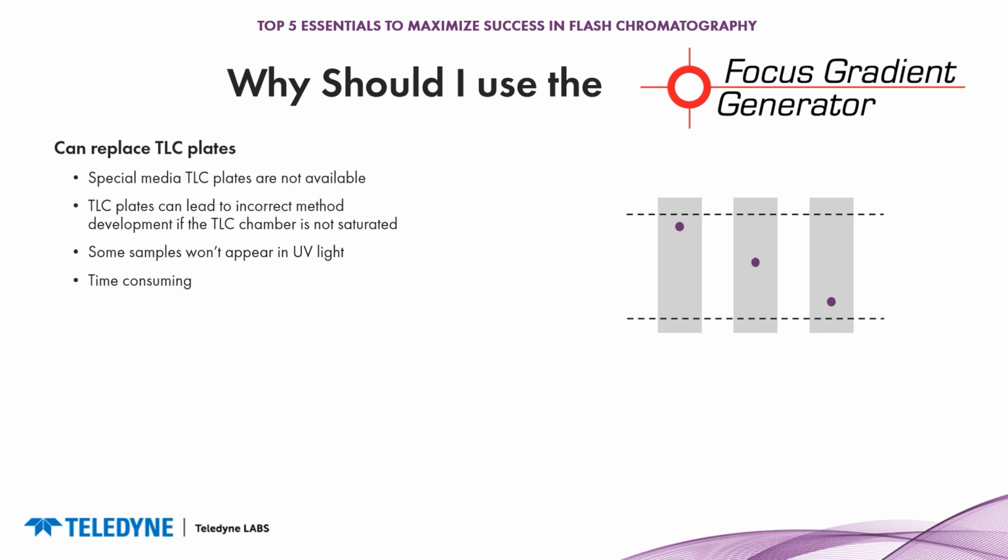A lot of the time silica TLC plates are going to be available in the lab. But what if you want to look at reverse phase and see how your compound interacts with a C18 media or a C8? Well, those C18, those C8 TLC plates are going to be a lot harder to find within your lab. Another reason why you might not want to use TLC is a lot of the time our TLC techniques aren't up to par. We're not saturating the chamber. My colleague Jack Silver actually wrote a great paper about this titled "Let Us Teach Proper Thin Layer Chromatography Technique."